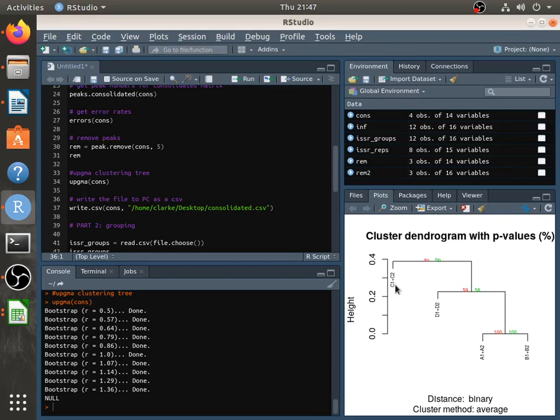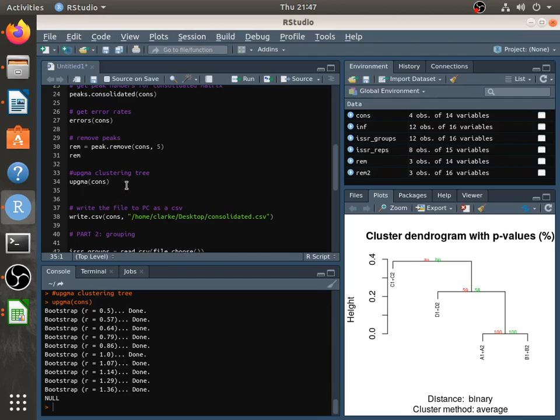So you'll see here how your samples have clustered. Let's say you want to run this. This is the consensus with all the samples, but let's say you wanted to do it with the set that has had that sample C removed. You would just run it the same. Here you go. See, it's just minus C.